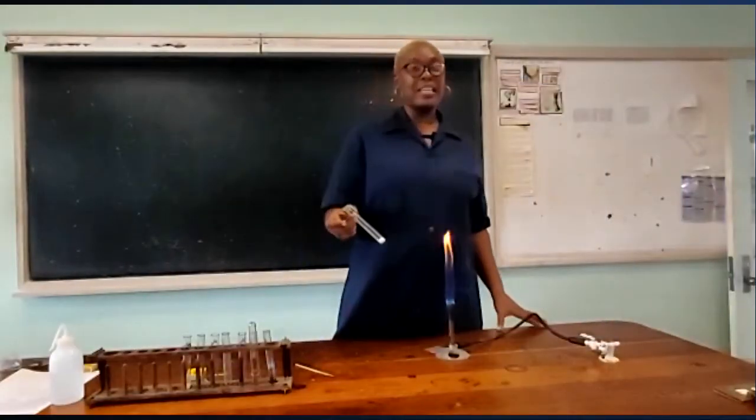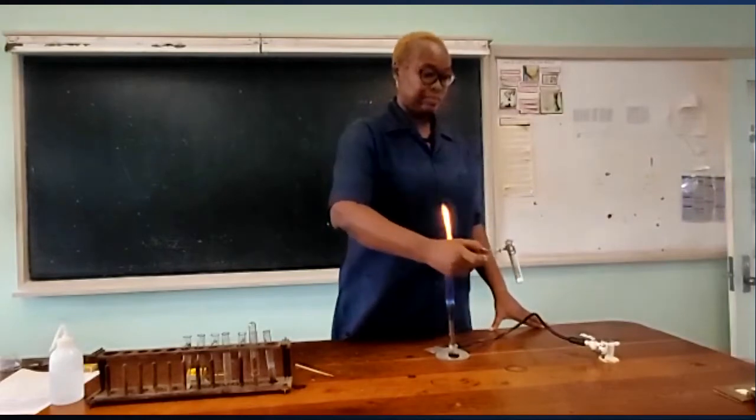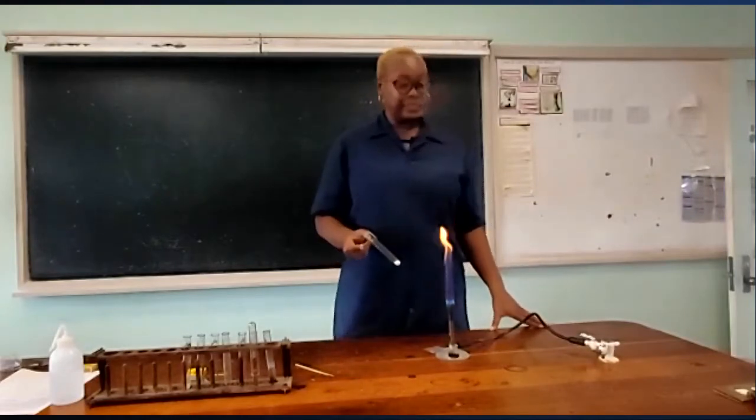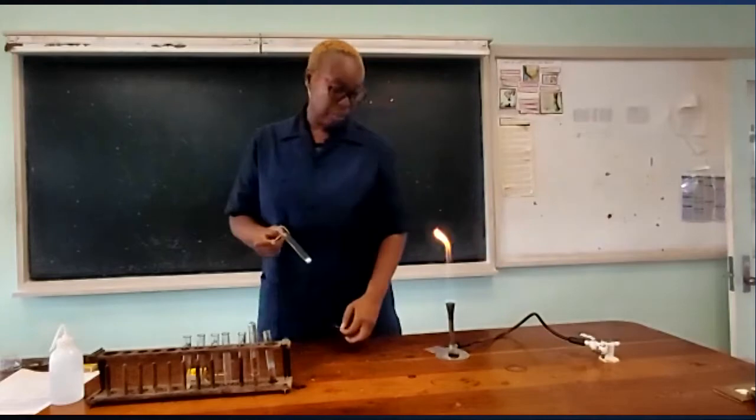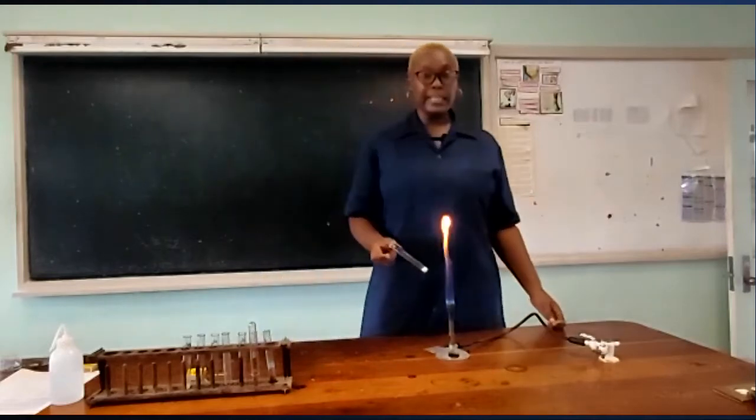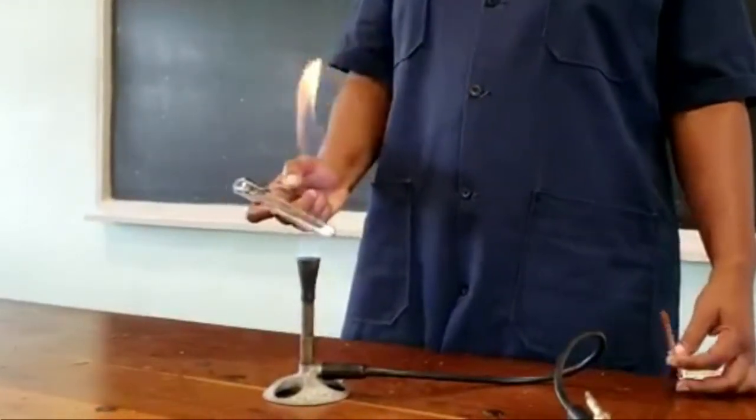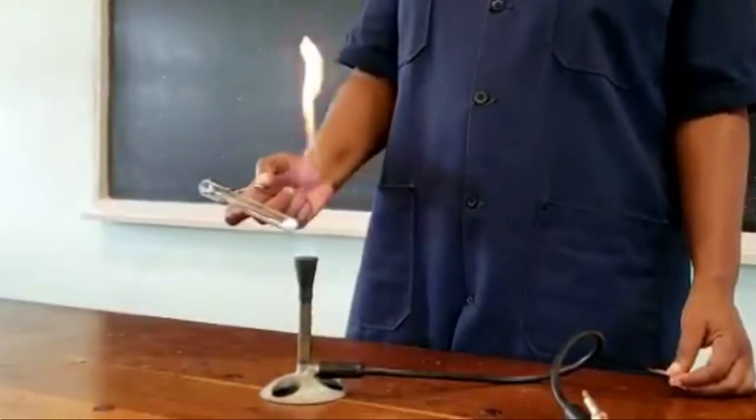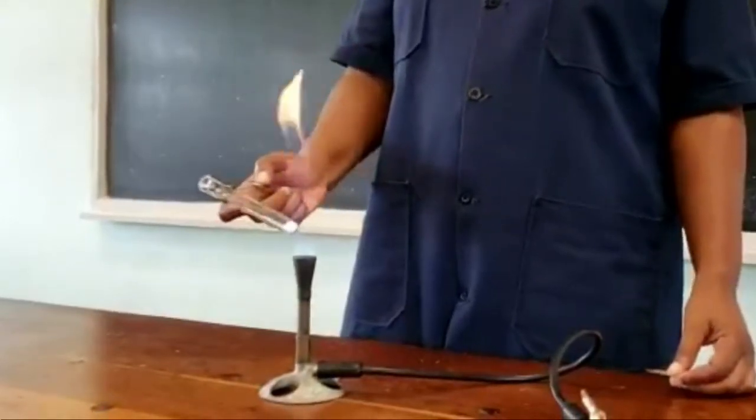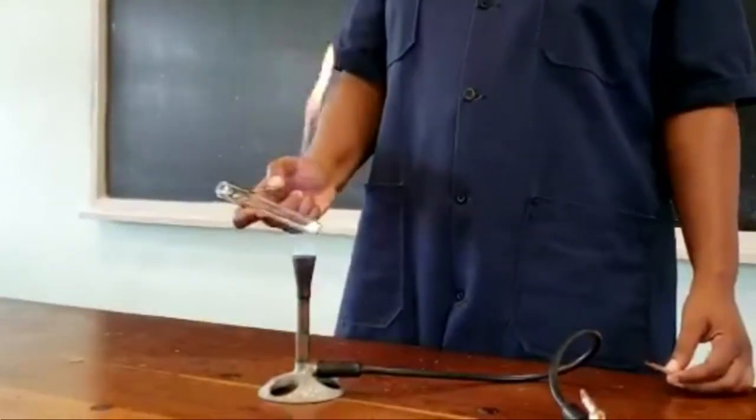So we have the white crystalline sodium nitrate and we're going to be heating it to determine or to investigate how stable it is to heat. We're heating it in the blue part of the flame. Remember the blue part of the flame is the hottest part of the flame.